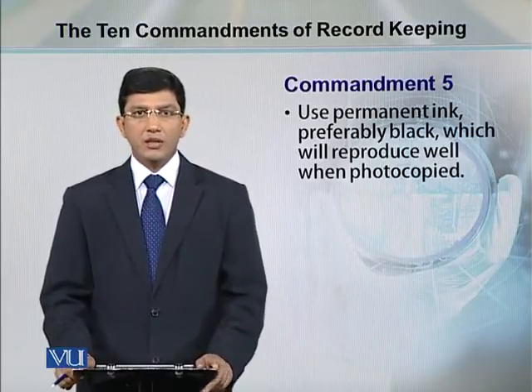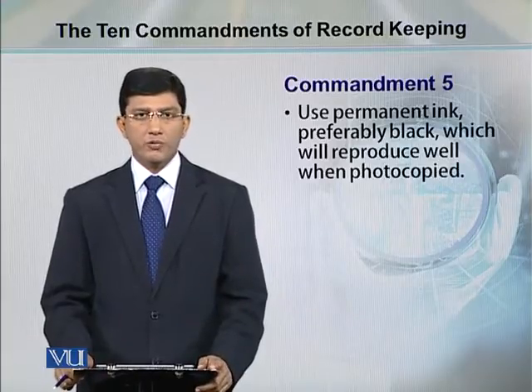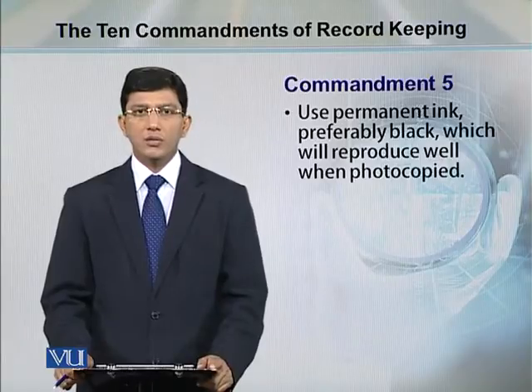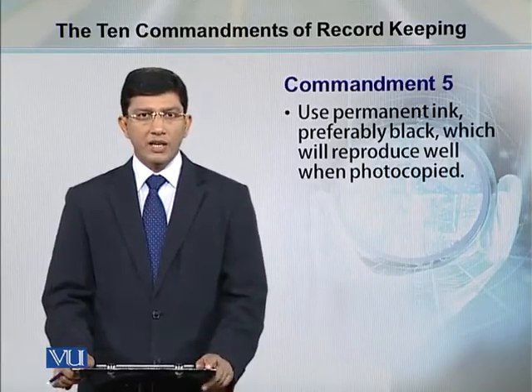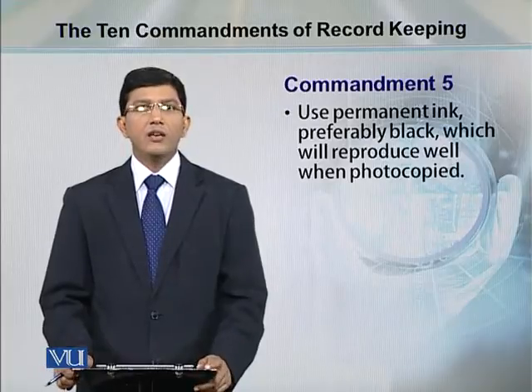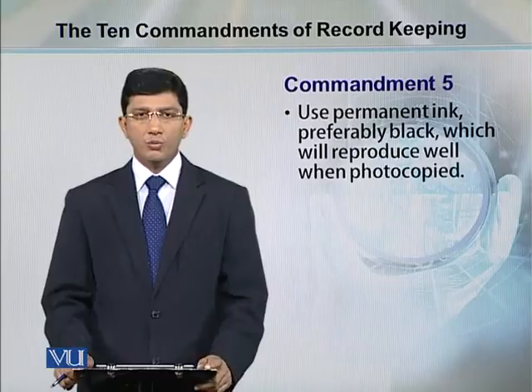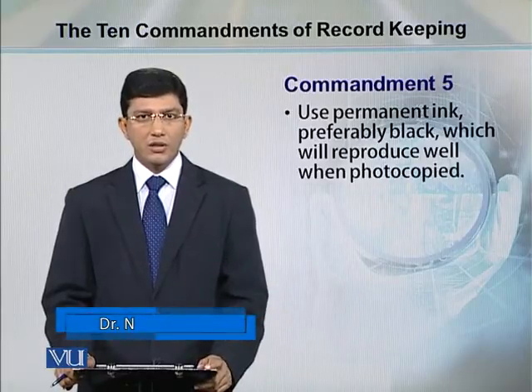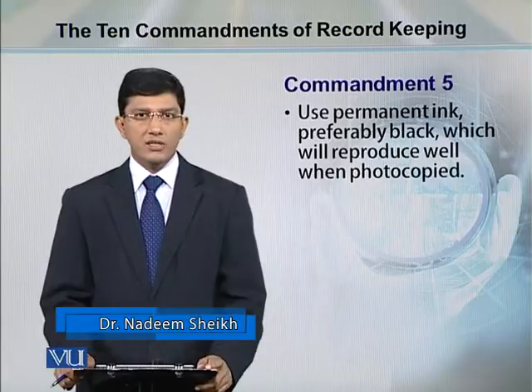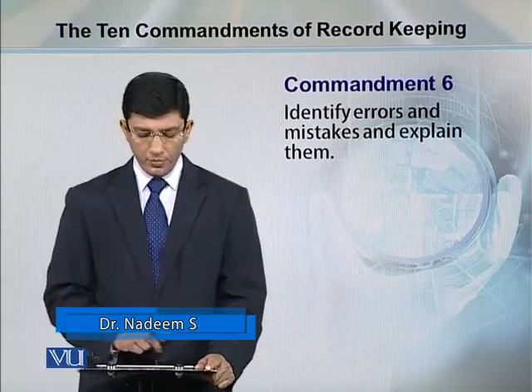Whenever you write something in the notebook, occasionally you may need to make a photocopy for your personal use or to give it to some of your colleagues or lab mates. In that case, if black ink is used to make your observations in the notebook, that will give you a good photocopy. Otherwise, there is likely a chance that some things are missing from the photocopied protocol.